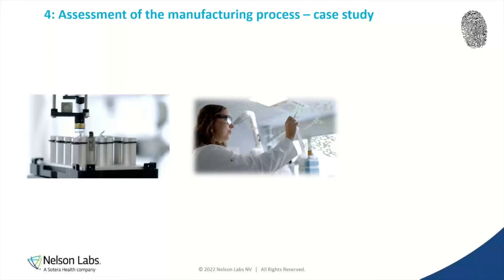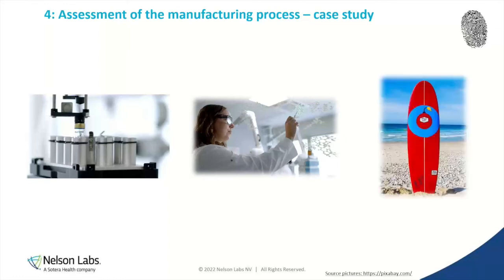So we did some investigation and we found that there was a residual that came off from the new device. We ran some chemistry because we really couldn't figure out where this was coming from. And it turns out that the residual we found is a chemical that's used in surfboard manufacturing. Guess who their new neighbor is at their facility? They share a building, just in separated locations within that building. So there was actually a problem with the air ventilation system. The solution there was to correct the air ventilation so they would have separate systems.